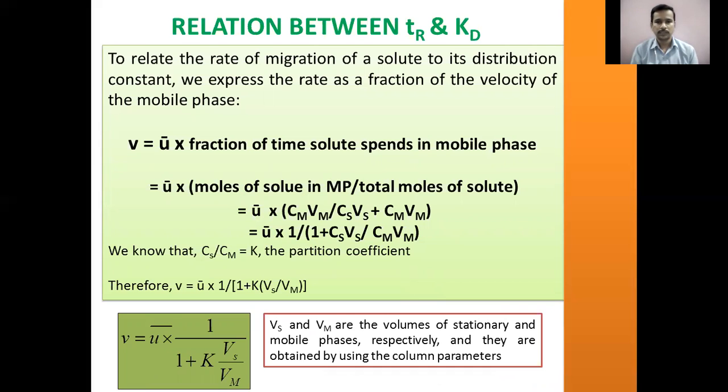coefficient or distribution constant. You take any chromatographic technique, the separation process involved in the chromatographic separation is fundamentally due to the interaction between the solute and the stationary phase. And we know from the chromatogram of the chromatographic separation what we obtain. The retention time is defined as the time taken by the solute to reach the detector once the sample is introduced at the head of the chromatographic column. So the retention time is a solute characteristic.